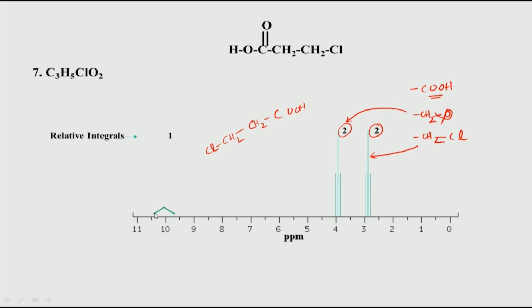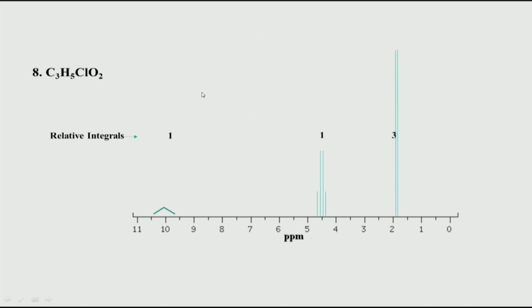Okay. So, the main important point is that a peak is observed which corresponds to a carboxylate group. So, let us look at the next example. Again here this seems to be the same molecular formula as we saw in the previous slide. So, that means it is a structural isomer of the compound.